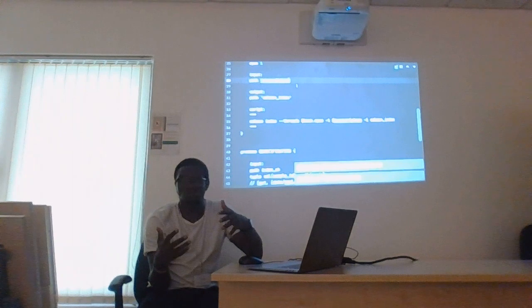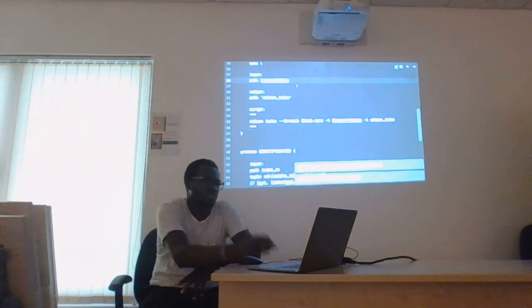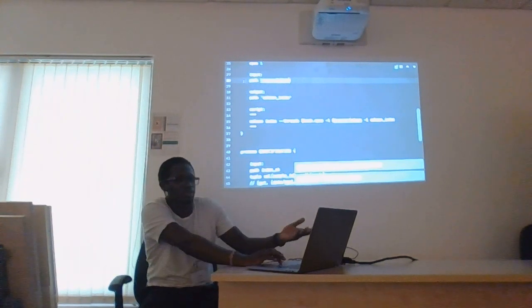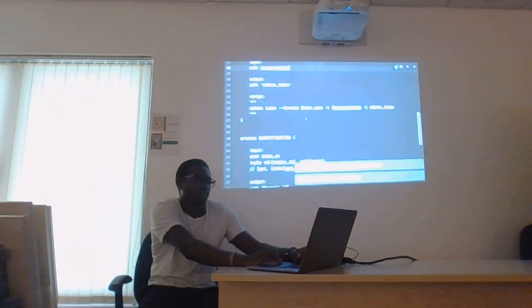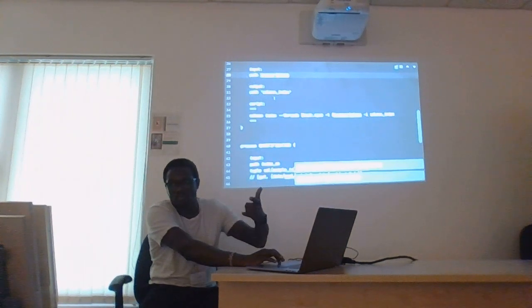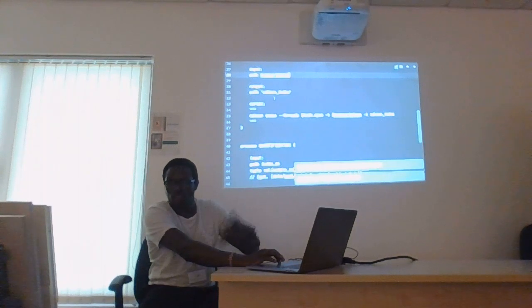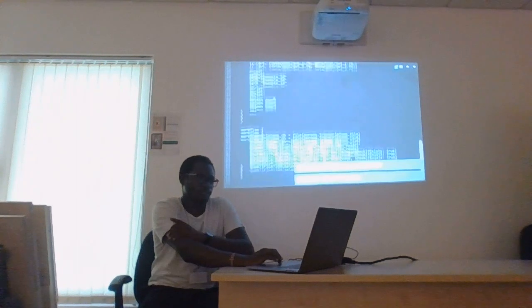Nextflow gives you that ability. Maybe you want to collect all the channels, and such kinds of manipulations. But as Kibet says, in this example you're only using one input, but you can have several, similar to output channels, you can have several of them. And it's not necessarily that if you have different output channels, you will require all of them for the next step. So you will also have to keep transforming your channels as you move along.